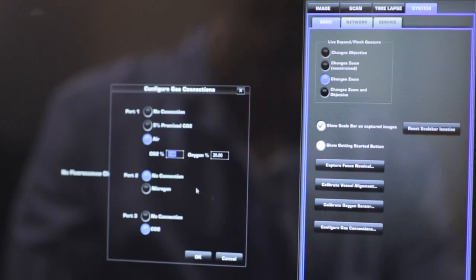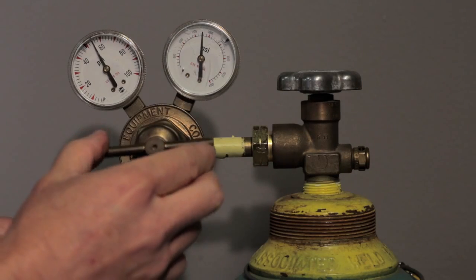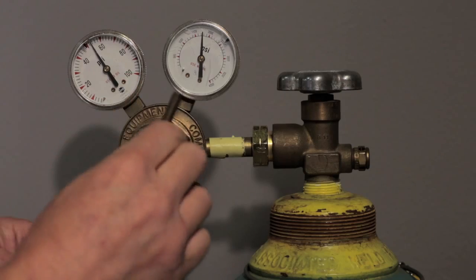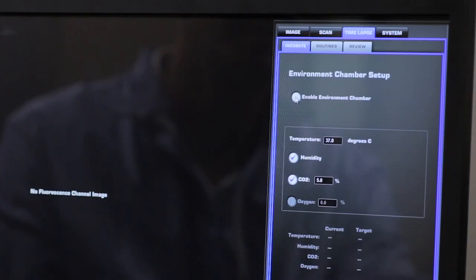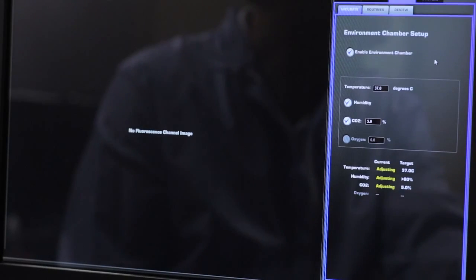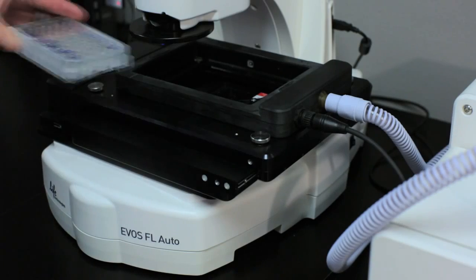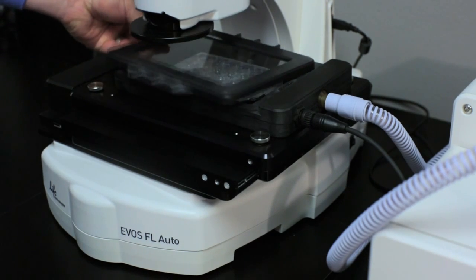Go to the Settings tab to open Configure Gas Connections. Turn on the regulators for the gas tanks and adjust the flow to 5 for CO2 and 30 to 40 for compressed air. Under the Time-lapse tab, select Incubate, then Enable Environmental Chamber. Adjust the desired temperature, humidity, and CO2 percentage. If you are using a premix tank, do not select CO2. The system typically takes 10 to 15 minutes to reach desired levels, after which you are ready to add your cells for imaging.